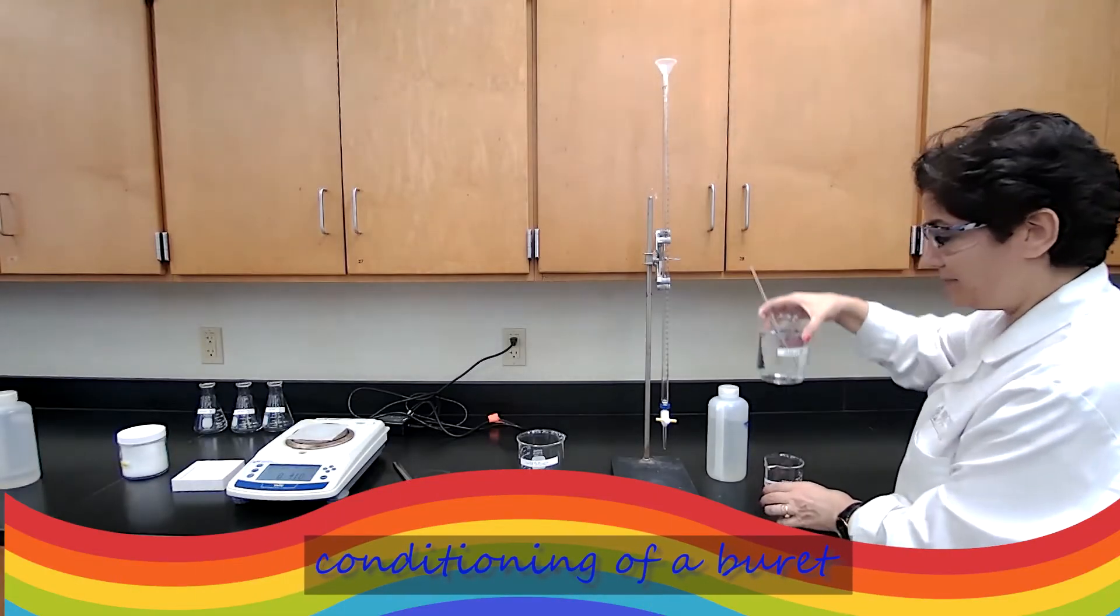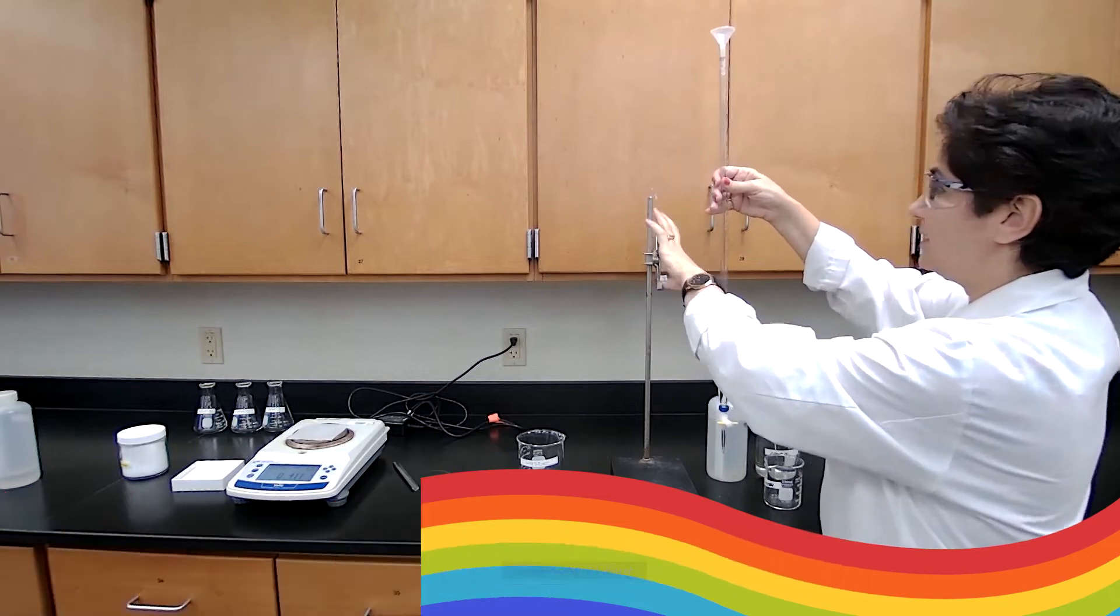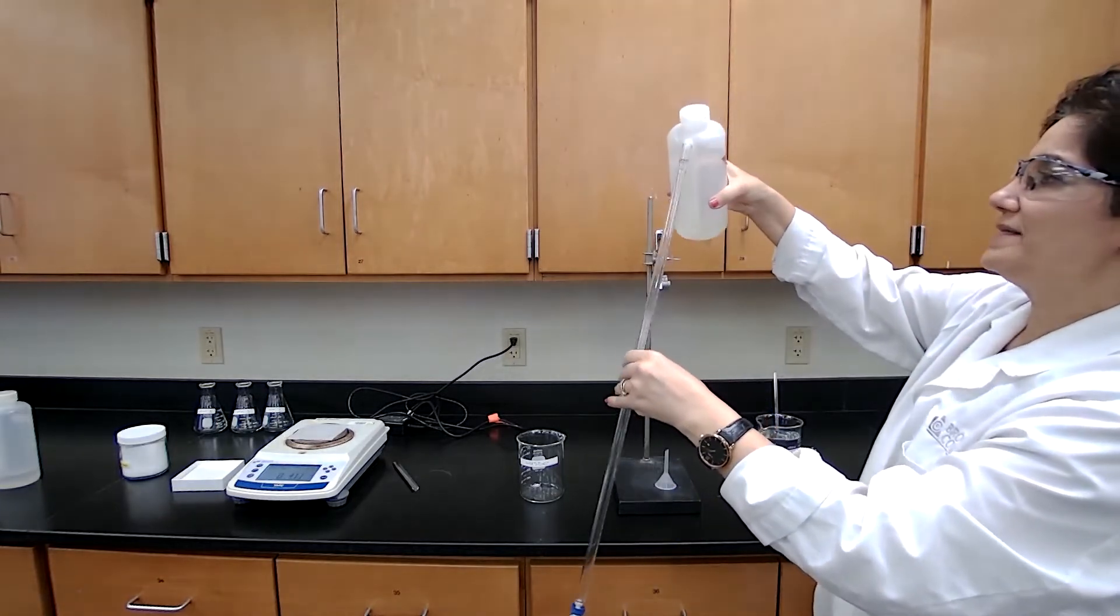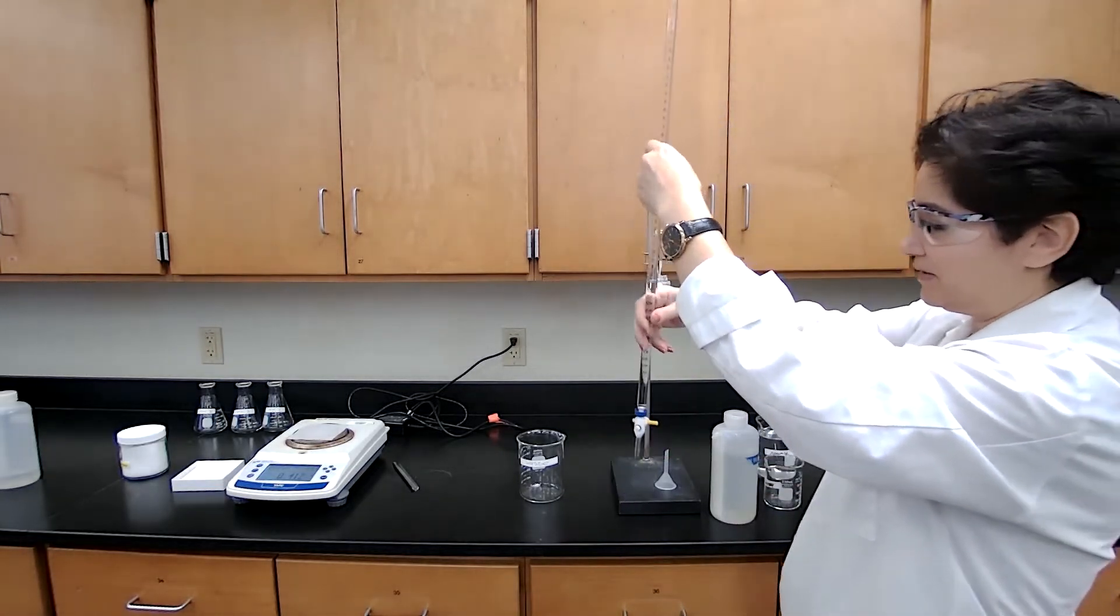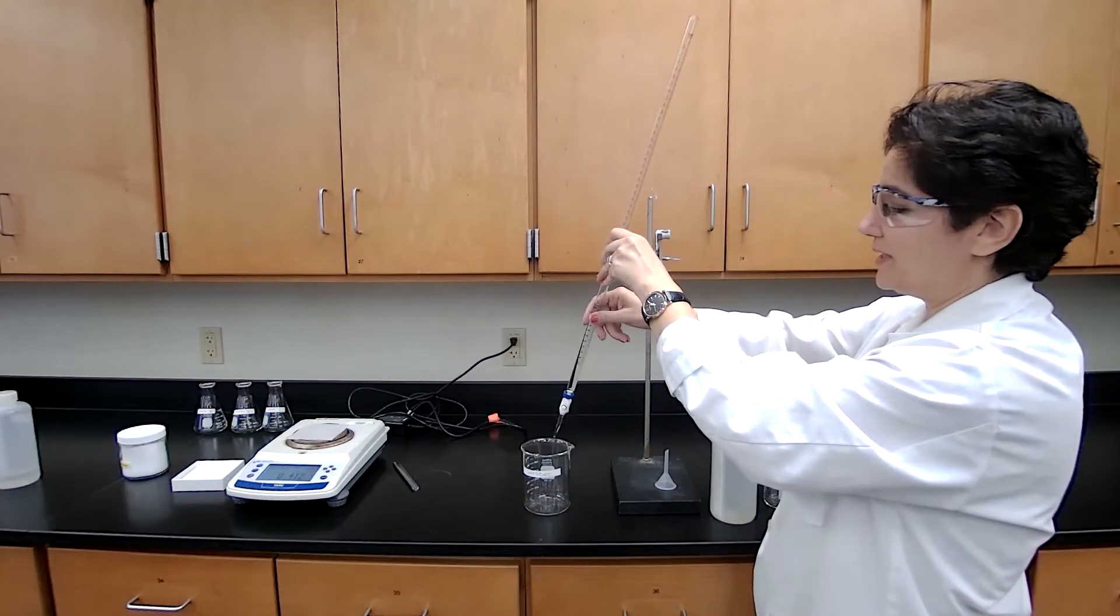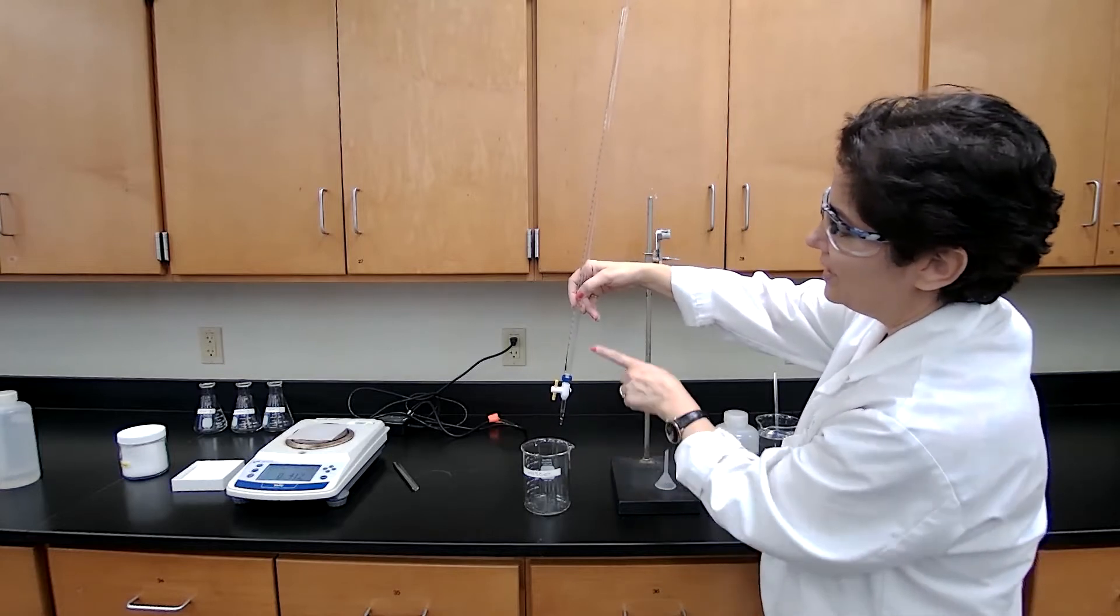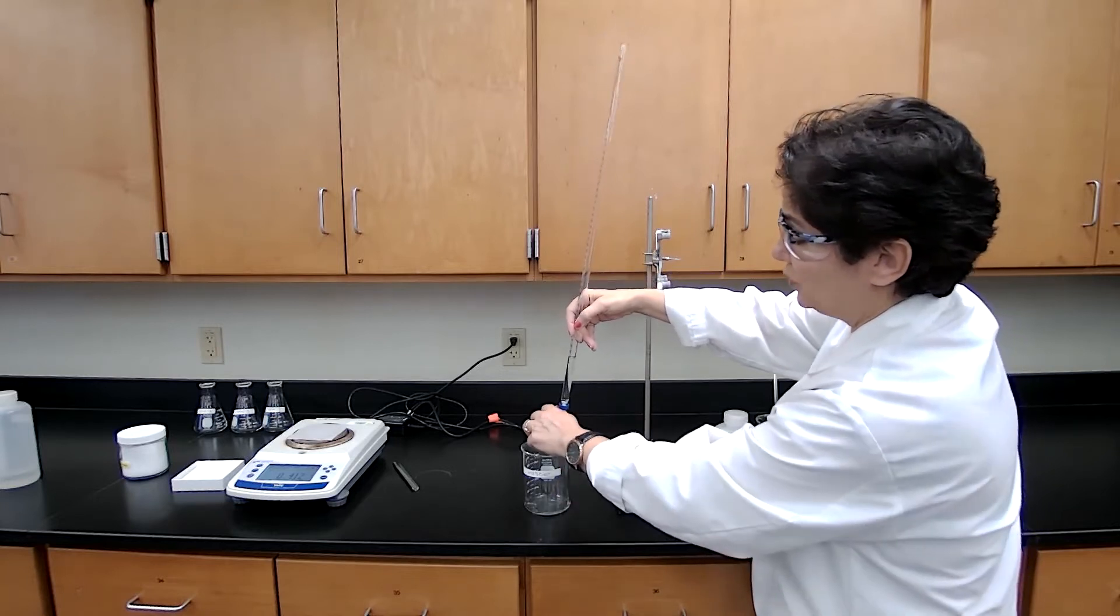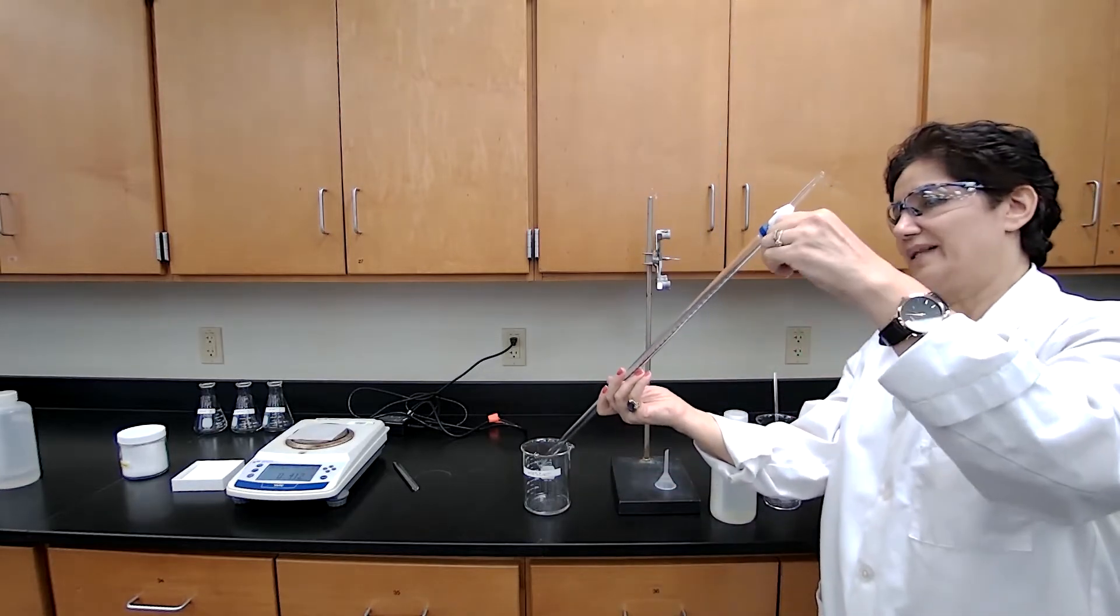So I have the sodium hydroxide I made already by dilution. I'm going to fill up the burette but burette needs to be conditioned first. To condition the burette we are going to first rinse with deionized water. The good thing about performing this part of the conditioning is that we already checked the burette is working. When I open this stopcock for the burette which is in the vertical position, liquid should be transferred out. Luckily it's working now. So by using the deionized water that part is done.